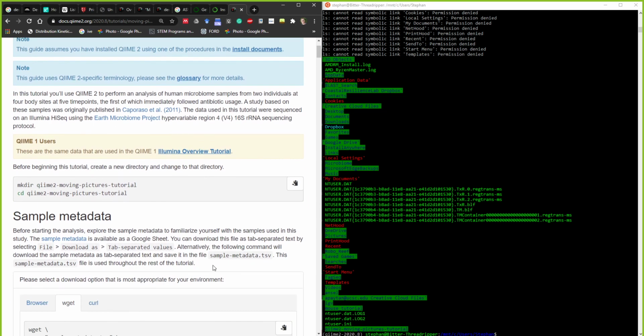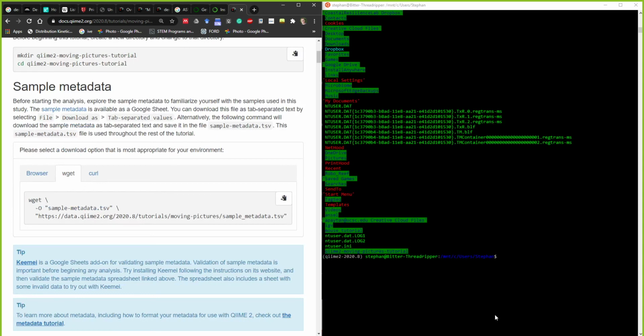When I do that, I get an error that there's no such file or directory. When you did mount C users? Did you ls after it to see what your username was? Because mine was different than what I thought it was. It won't let me into either just users with no name after it or with my username added.